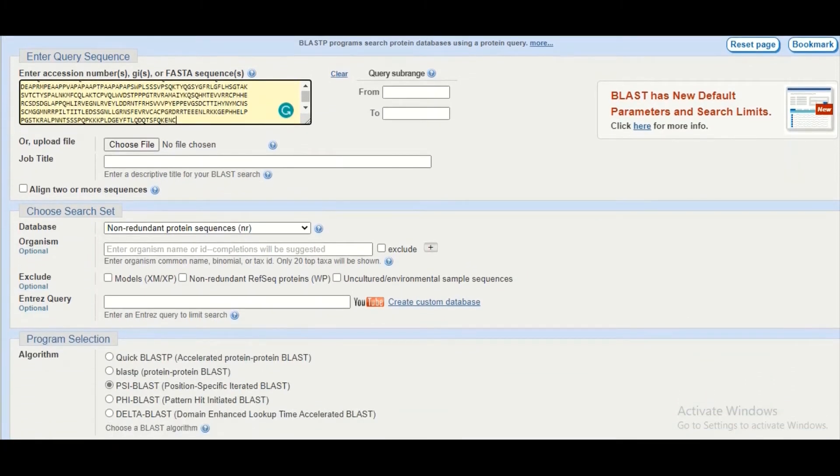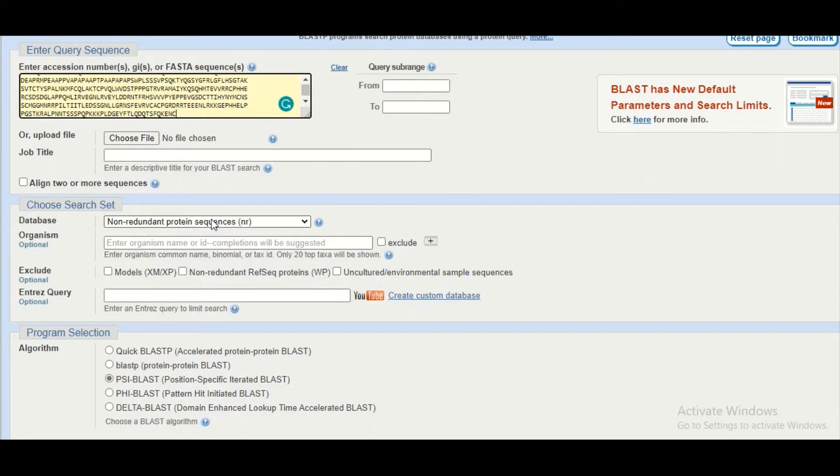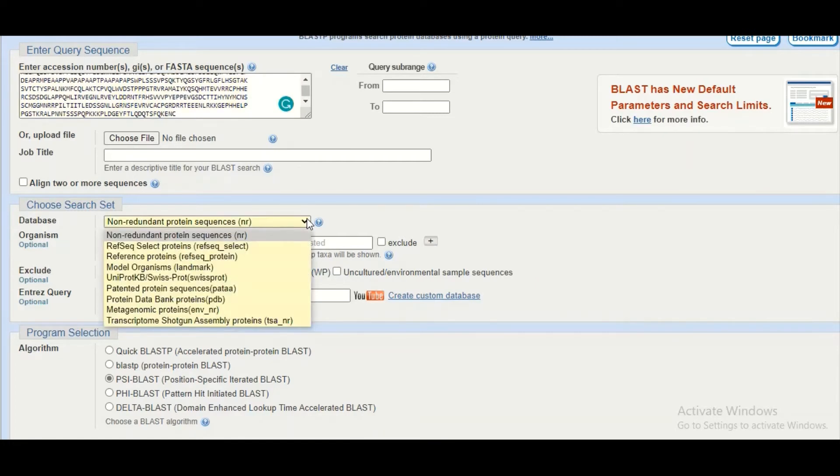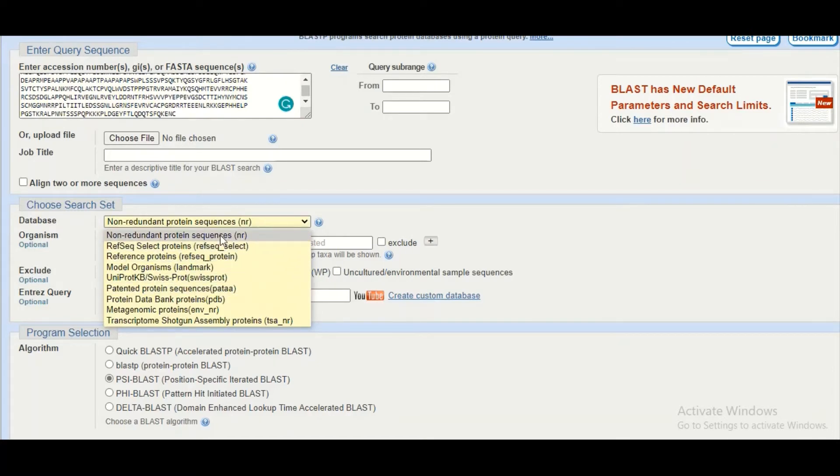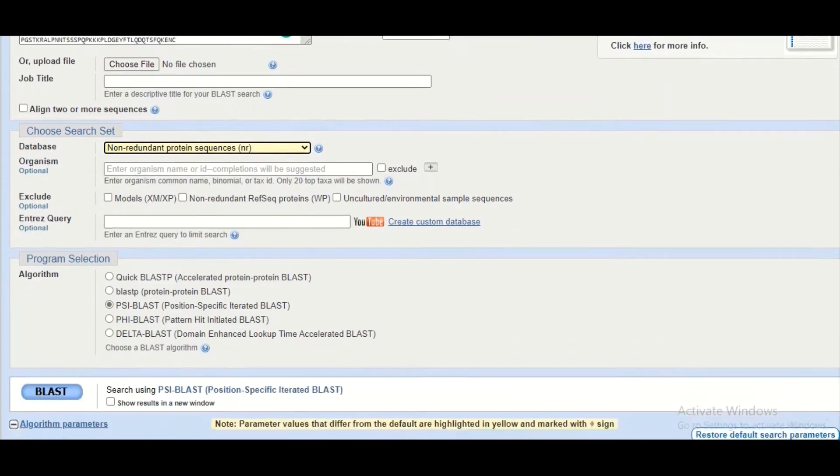We will select the most appropriate database. Again in this search we are going to select the non-redundant protein database. You can select other databases as well depending upon your need.